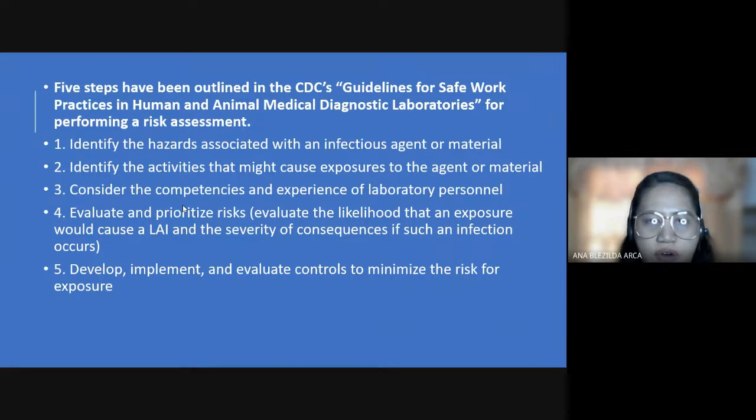Okay? So according to CDC, there are guidelines of the safe work practices in human and animal medical diagnostic laboratory for risk assessment. First is that you have to identify the hazards. You have to identify the activity that might cause the exposure to that agent or material. You must also consider the competencies of the laboratory personnel.